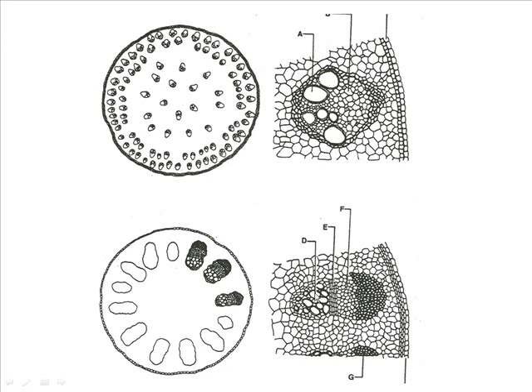What would this be here? Primary phloem. What would this be? Primary xylem. And what could this be here? Could be residual procambium. All right, ladies and gentlemen, those are your monocot and dicot stem cross sections.